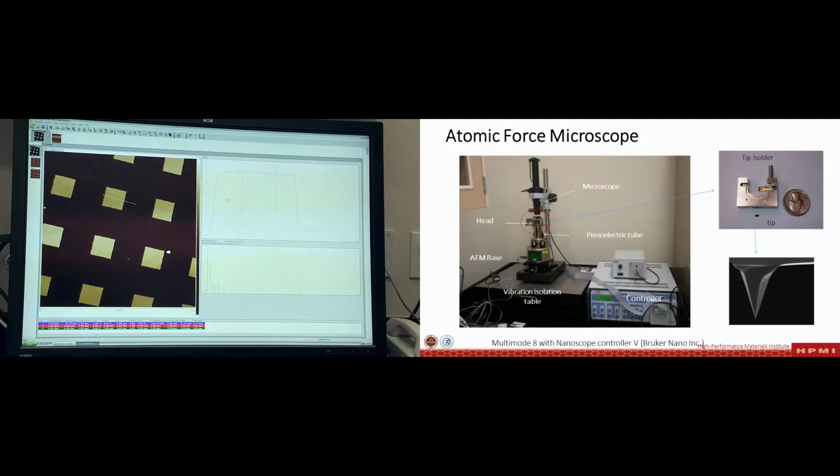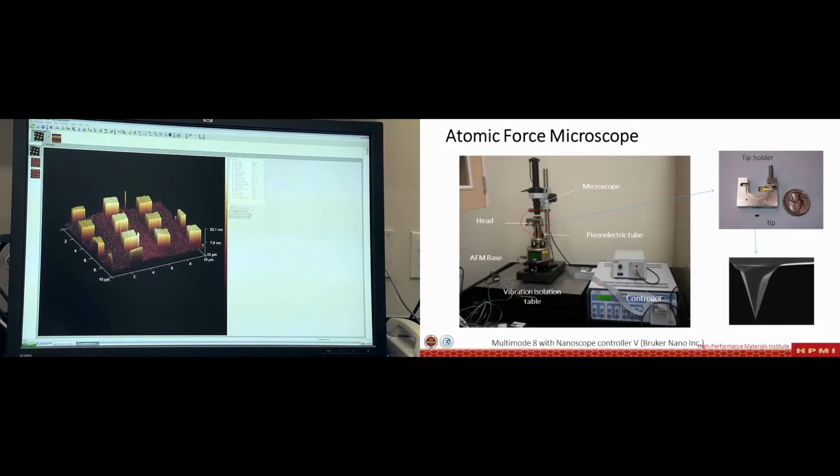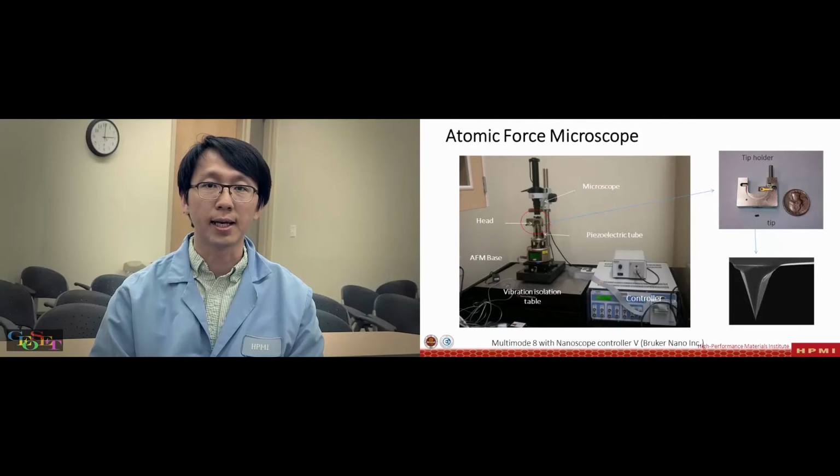Now the scan is finished. Then you can select an area you want to zoom in on, and you can move it, zoom in, and then execute it. It starts to scan again and captures the image again. So you can just keep going on and on with different areas if you want.